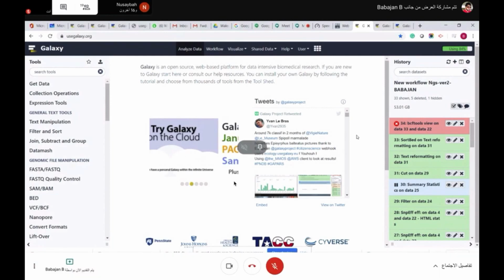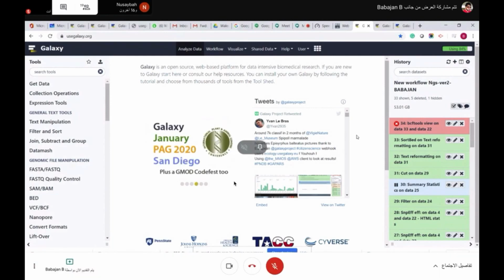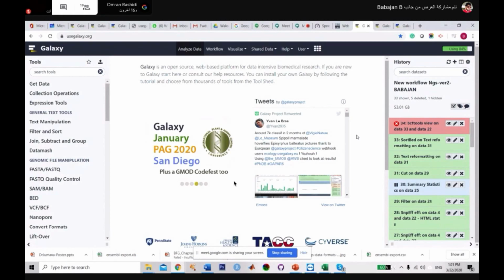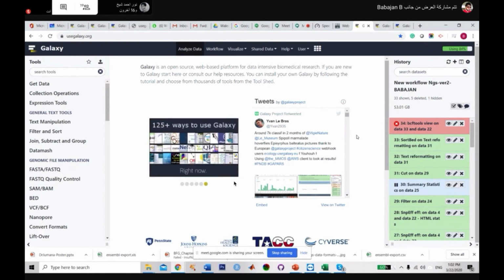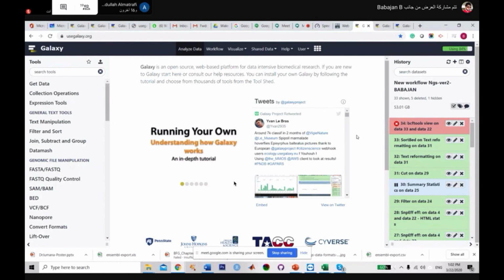There are some advantages I just spoke about. The disadvantage with Galaxy is that it has limited space. It allows one user, for one email, 200 GB of space. Previously, when I started to work with Galaxy, they gave only 50 GB of space. We're lucky now, they extended this one. Now we have 200 GB that we can access and store our information in.